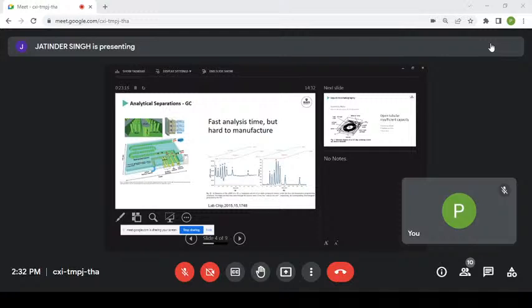Our analyte mixture is being injected here with a normal off-chip injector as a small injection plug in our carrier. It moves through our column and the analyte sees all the pillars. The analytes that really like our stationary phase, the sticky ones that always stay last at the party, spend a lot of time sitting on that pillar. It gets stuck here, then moves a little bit on with the airflow, then gets stuck here, then bounces on a little bit more, then finds a place on the floor to sit.